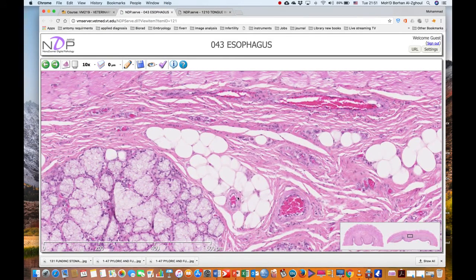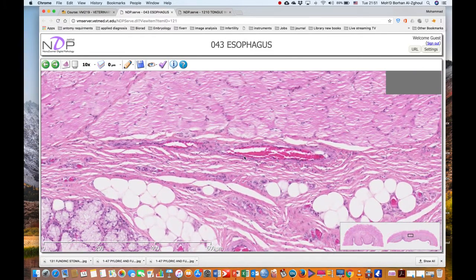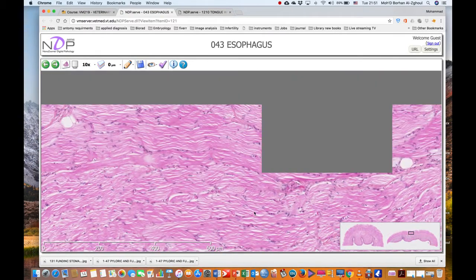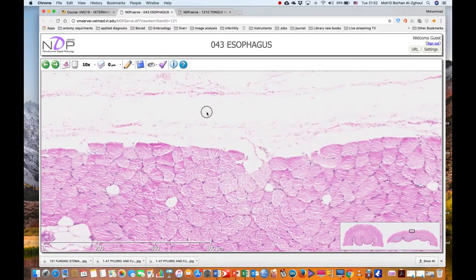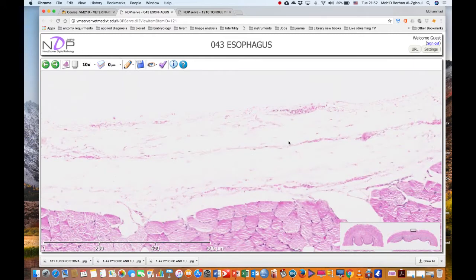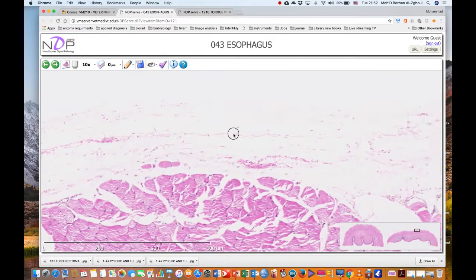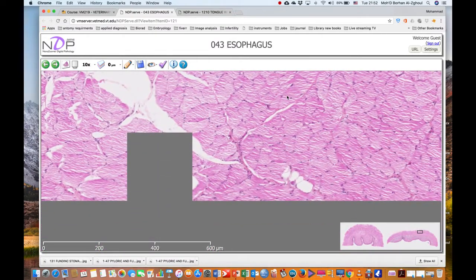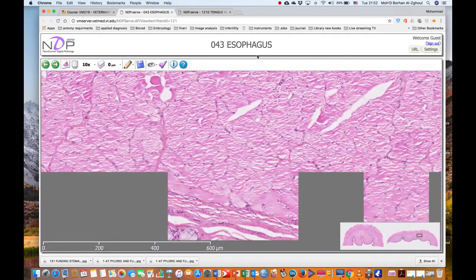It's an arteriole, there are a lot of blood capillaries, venule, this is the muscle, the nucleus found in the periphery, again, and on the outer side, the layer of the serosa, this is the epithelium, the simple squamous epithelium. Two layers, inner circular and outer longitudinal.